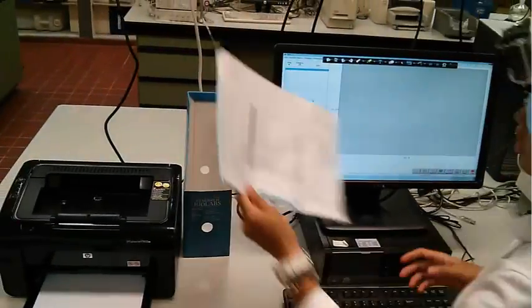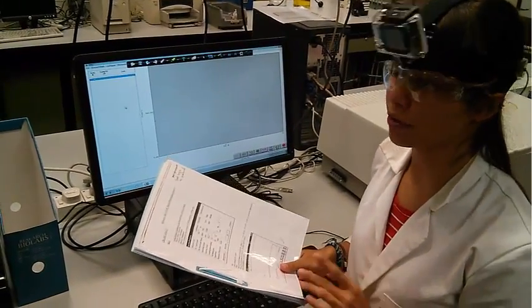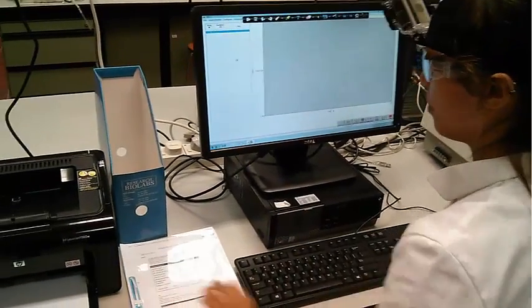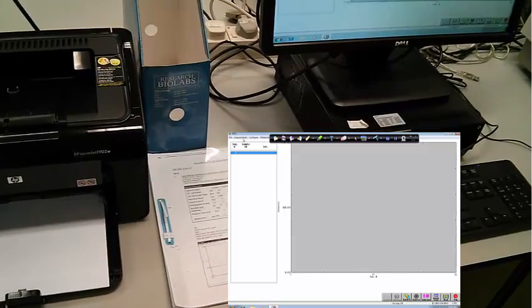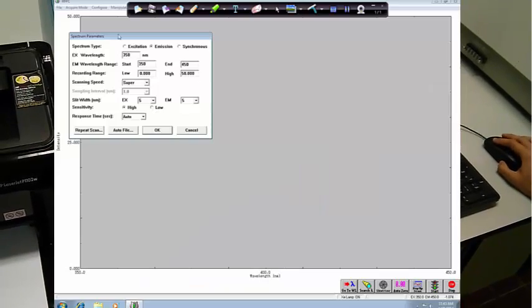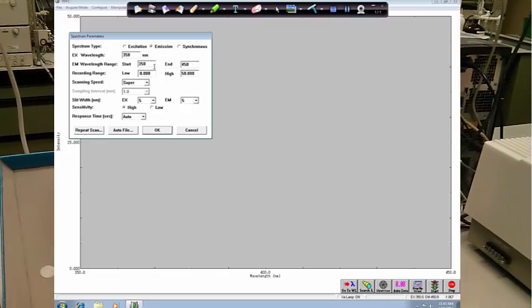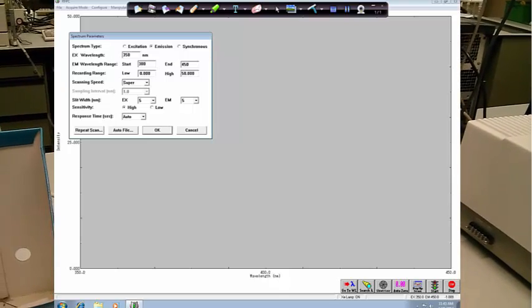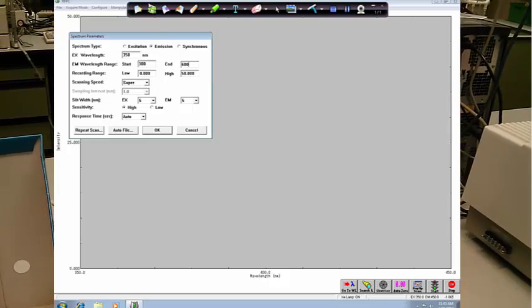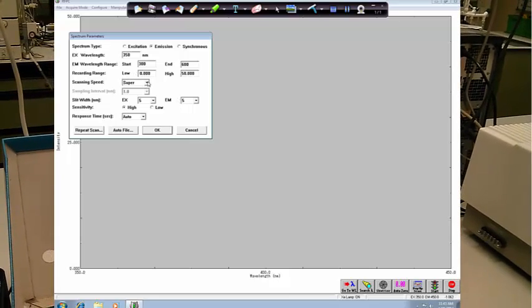During your practical, you will actually have all the information you need to carry out the experiment here in the manual. We're not going to go through that today because it's pretty simple and all you need to do is follow the instructions. We'll just run here the emission spectrum. So from here, go on to acquire mode spectrum. This is all your parameters here. We're doing the emission spectrum. We'll start at a wavelength of 300, which is consistent with your guidance here, and do an ending one at 600. That's the same as you would do for your first sample in your practical. You want to change this to fast.